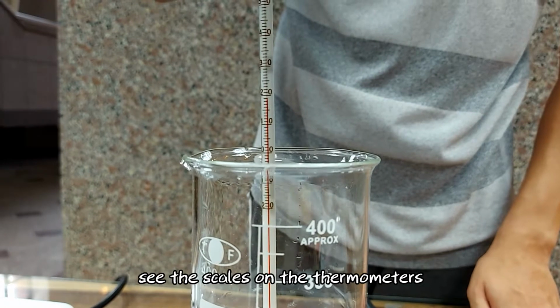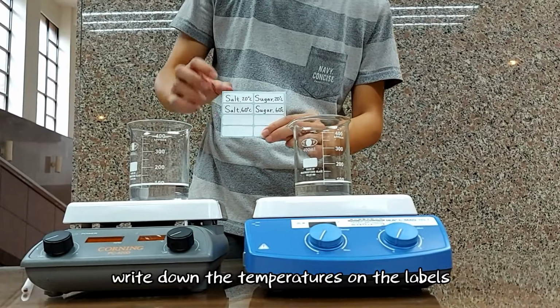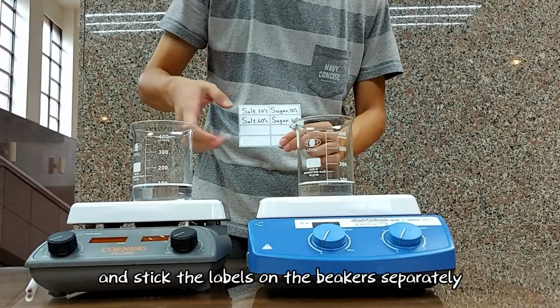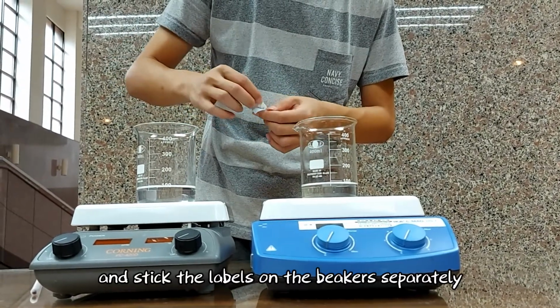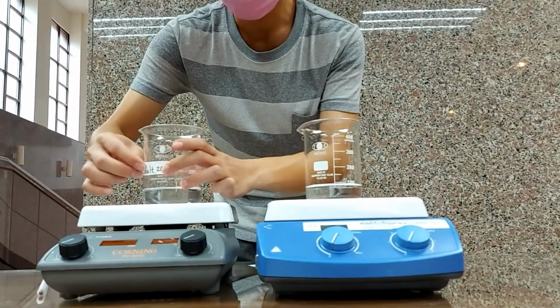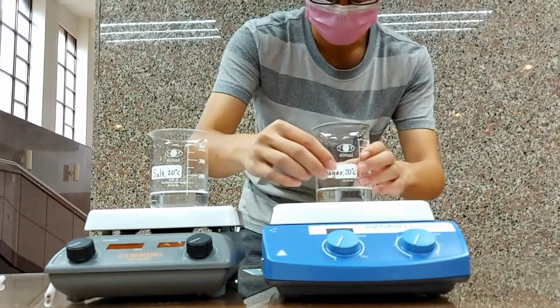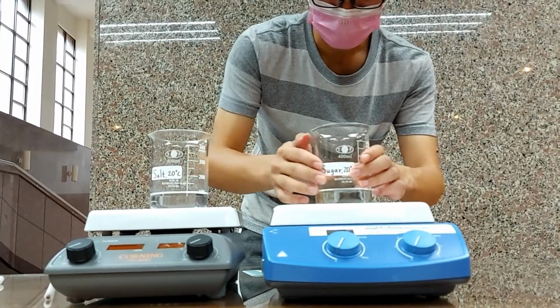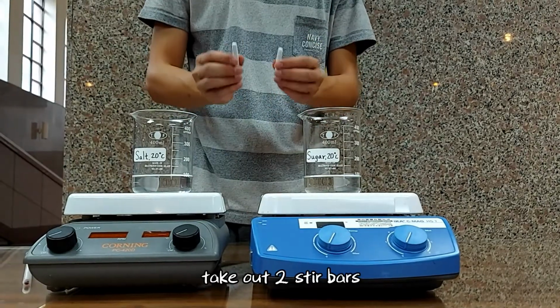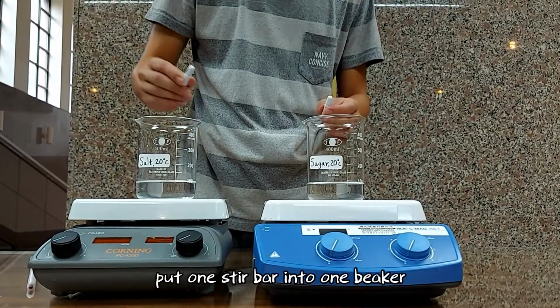See the scales on the thermometers. Write down the temperatures on the labels and stick the labels on the beakers separately. Take out 2 stir bars. Put 1 stir bar into 1 beaker.